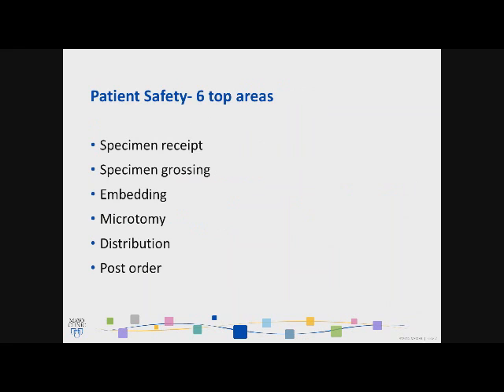These are the top 6 areas that I'm going to talk about. You can see that any of these areas have a possibility for the specimen to have errors, and I can say that, personally, working in this field for about 14 years, I have seen specimen mis-ID at any one of these areas. I'm going to talk a little later about possibility for changes as well as possibility for errors.